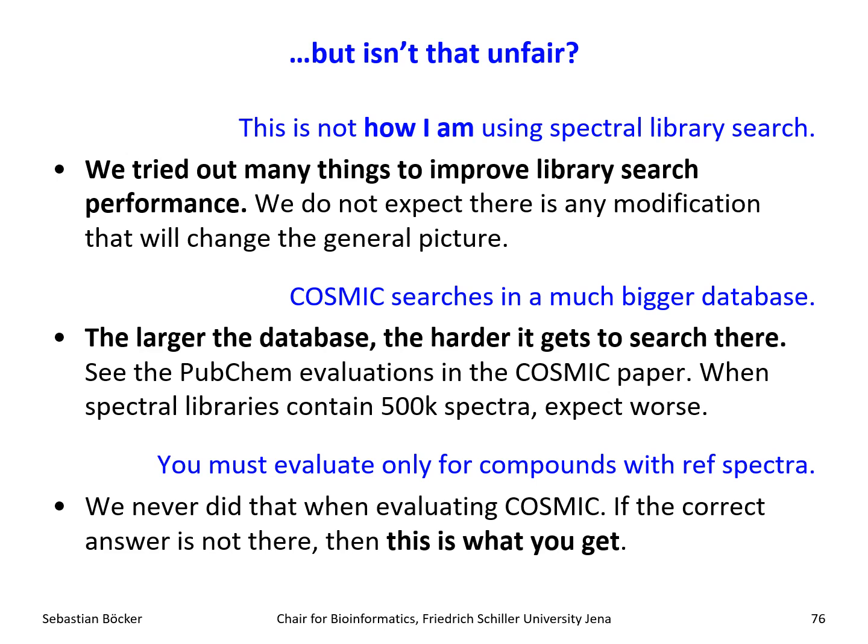And then there's the last and ultimate thing, and that is you must only evaluate for those compounds where you find a reference spectrum in the spectral library. And I can only say, what? That doesn't make sense. I mean, through all the evaluations that I showed you so far, we never removed those instances where the correct answer is not in the database that we search. This is just what you get. This happens. Bad luck. Live with it.